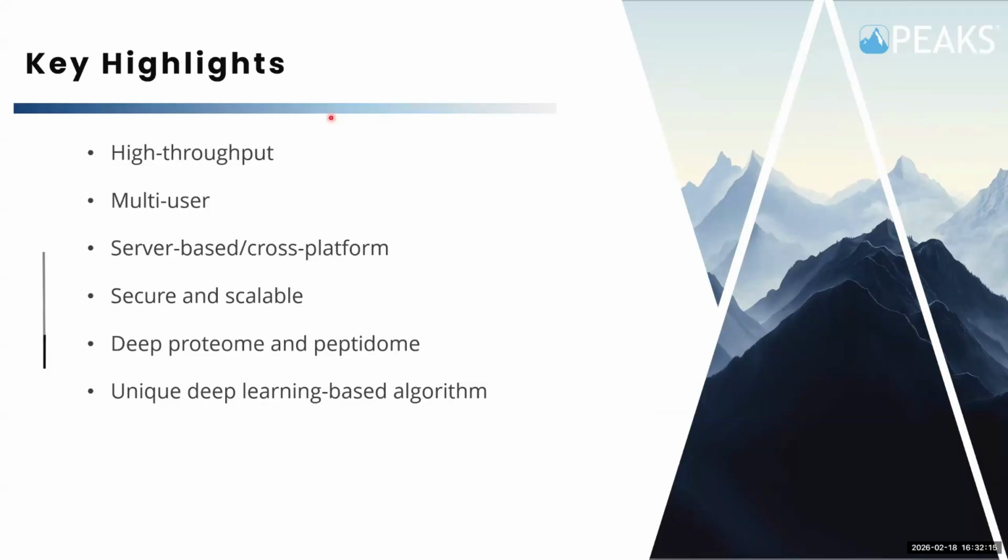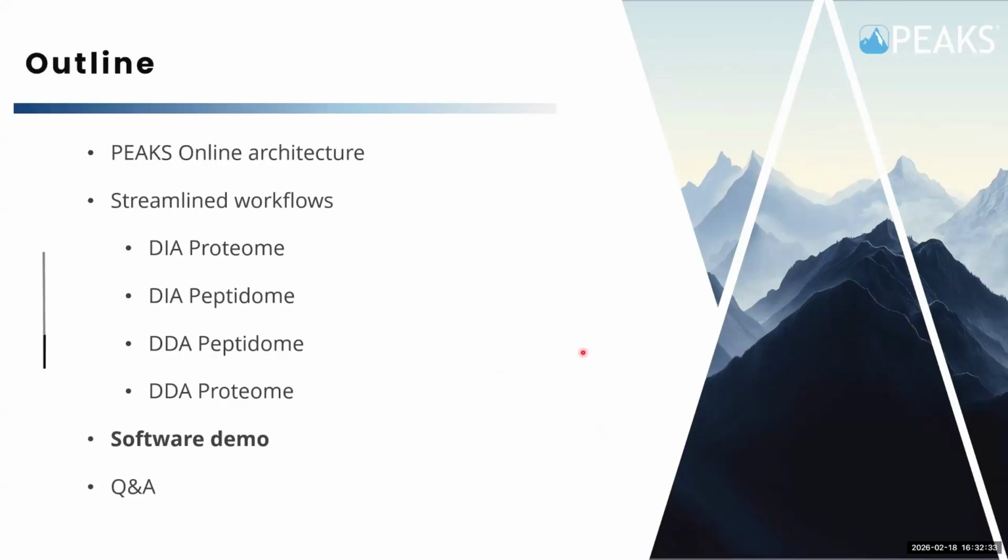So I hope I was able to show you how Peaks Online is high throughput, multi-user, secure and scalable. I also mentioned a little bit about our deep proteome and peptidome workflows and our unique deep learning based algorithms. Now I am going to jump into the demo.